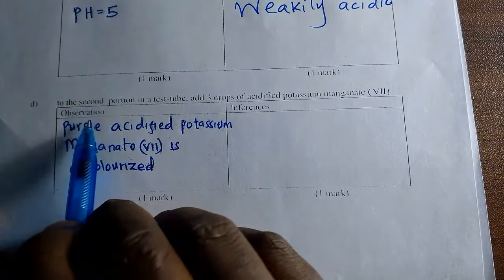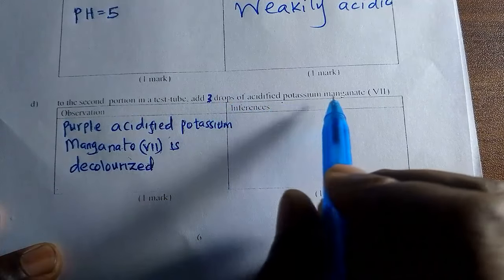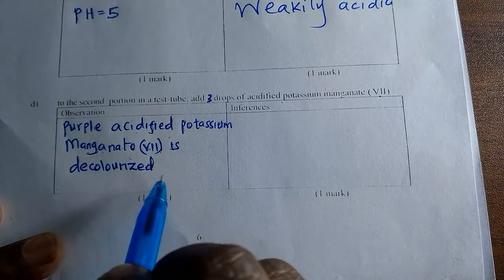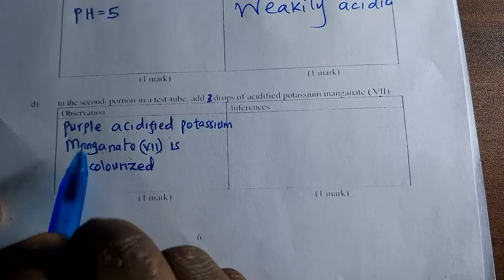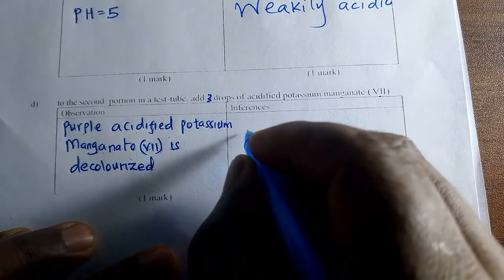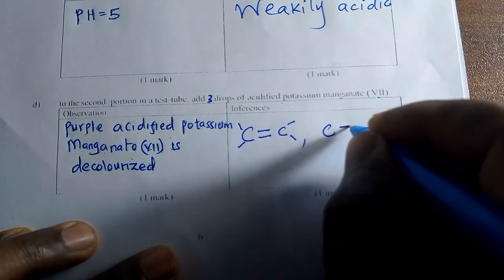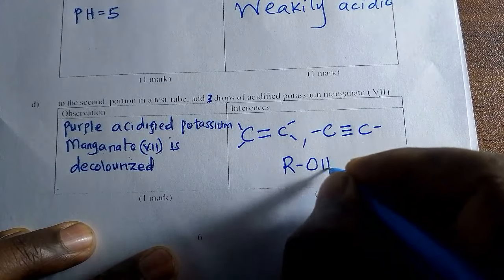To the second portion, add 3 drops of acidified potassium manganate 7, which is purple. Then the purple acidified potassium manganate is decolorized. In other words, the color of acidified potassium manganate changes from purple to colorless. If that is the case, then there are 3 things which are present: the double bond, or the triple bond, or the ROH is present.